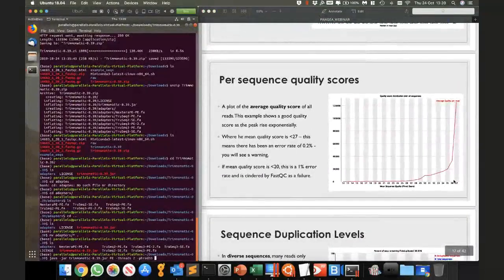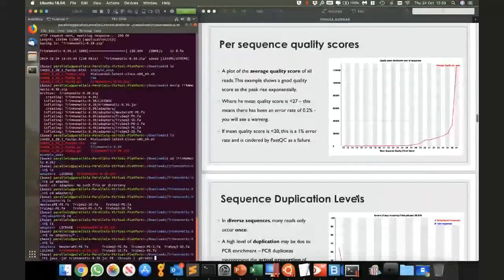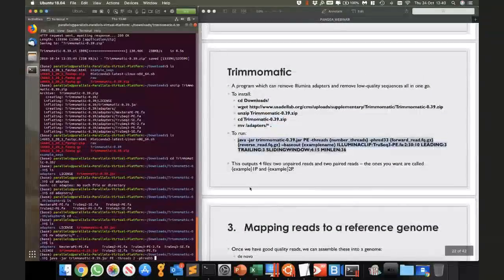These are the Phred quality scores. So 33 doesn't mean a Phred score of 33. It means something like, if the score starts with 3 and ends with something. You can look at all this in the manual if you want to really understand what's going on. But we use Phred 33, and then you put in your forward read and your reverse read.